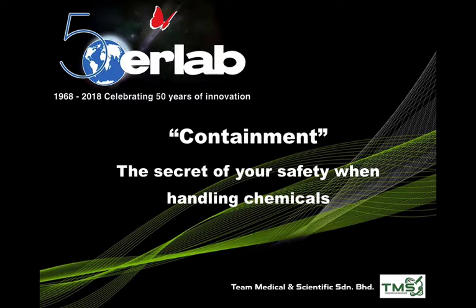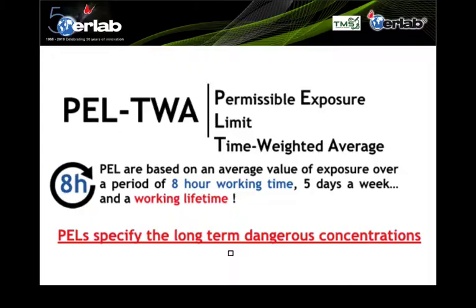This lecture is about containment, the secret of your safety when handling chemicals. When we talk about handling chemicals in the laboratory, we need to introduce the concept of PEL-TWA, which stands for permissible exposure limits, time-weighted average. In simple terms, it provides the maximum exposure limits for any chemicals within an 8-hour working time.